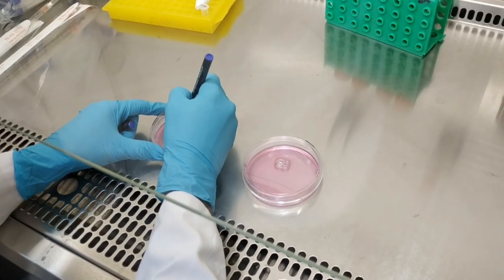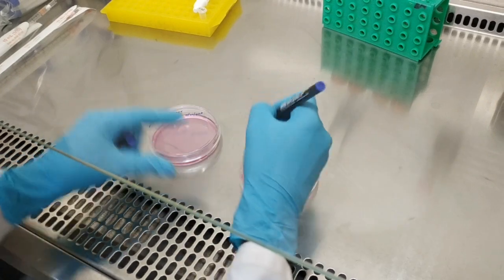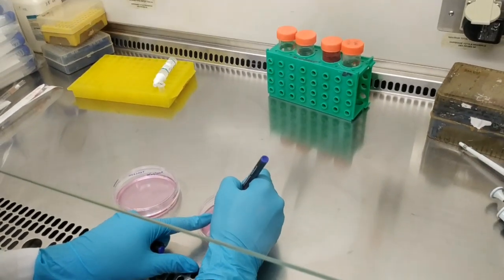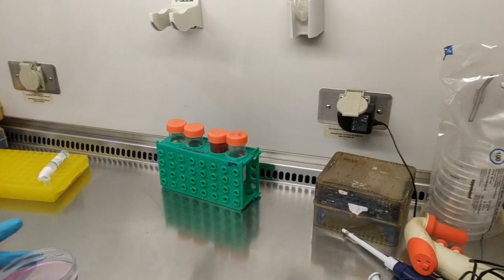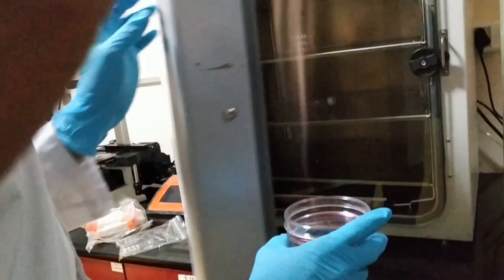You can keep it in an incubator at 5% humidified CO2. Then keep it in the incubator for 6 to 8 hours to let the cells adhere.